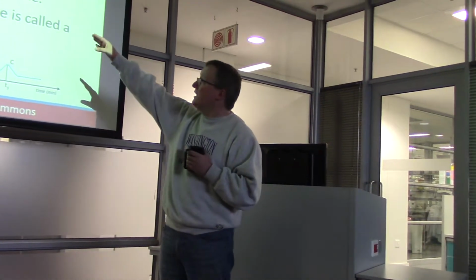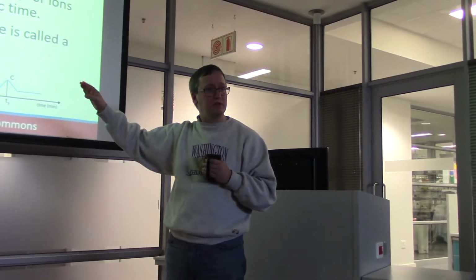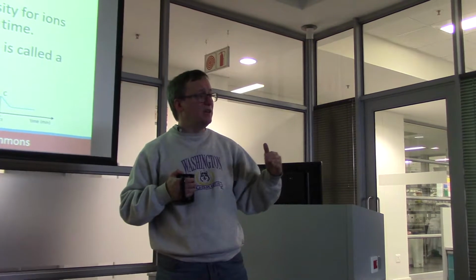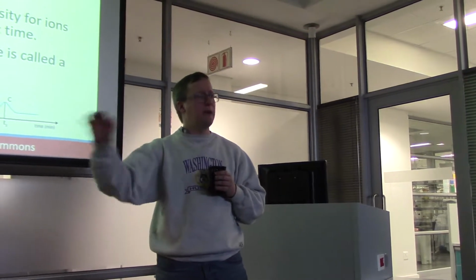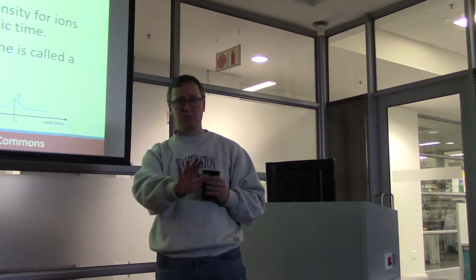So in our standard LC-MS/MS experiments, we are most typically using a chromatography called reversed phase liquid chromatography. This RPLC is giving us a time axis. As a function of time, we are seeing different peptide ions from a very complex peptide mixture. Everyone's good with that stage?